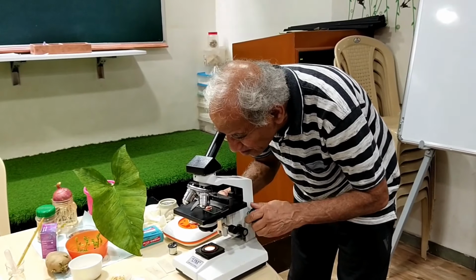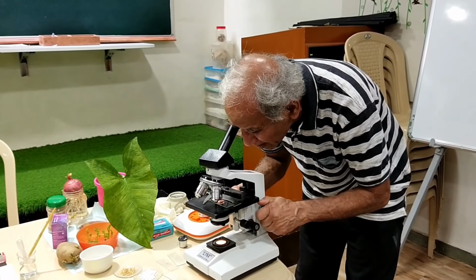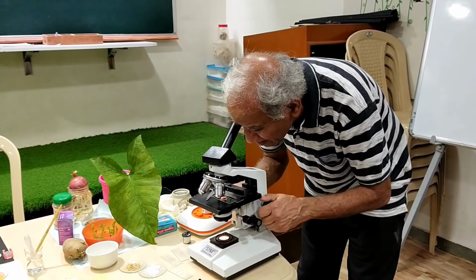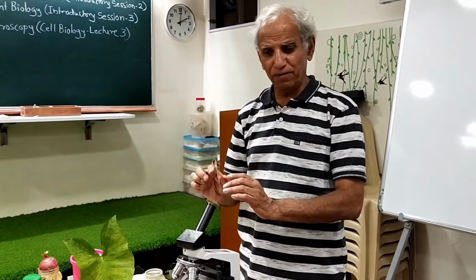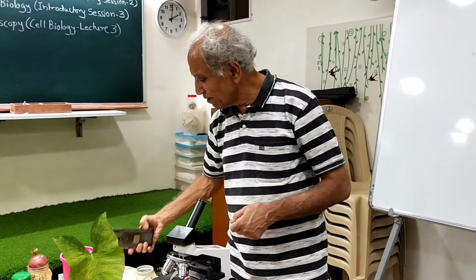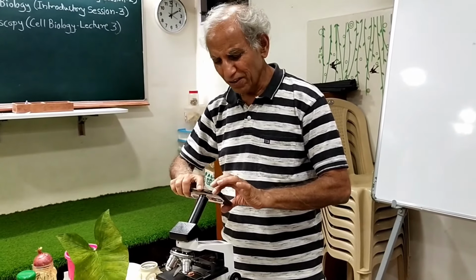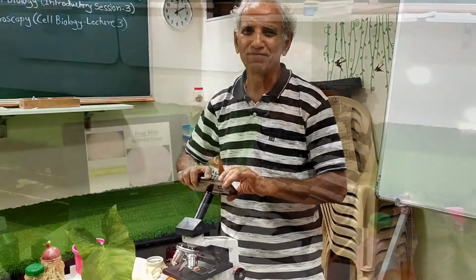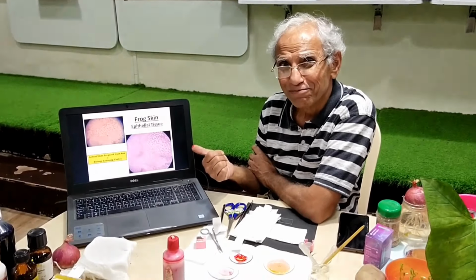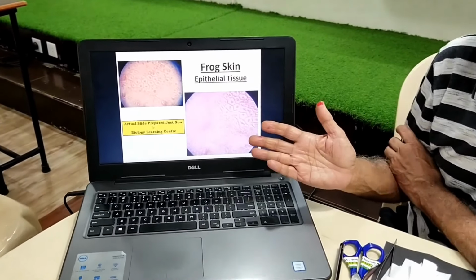Oh, the slide is coming up nicely. Oh, beautiful. It's really good comparatively. Okay, fine. But of course, we'll click a picture. It's possible for us to just put the camera of the handset here. It takes time, of course. We'll click a picture and then show it to you. Okay, let's go for that. Look at this. A beautiful slide has come up, and fortunately we could picture it nicely.